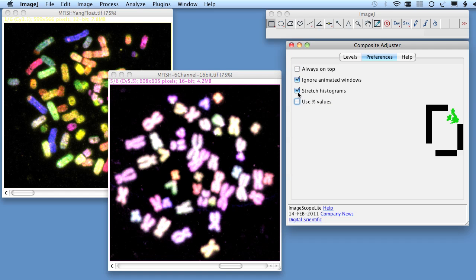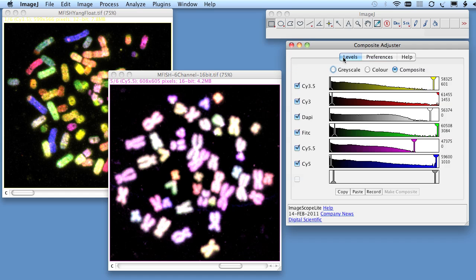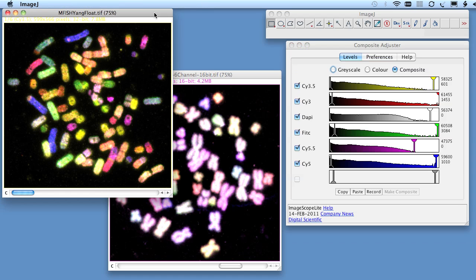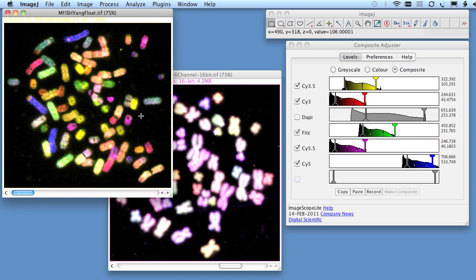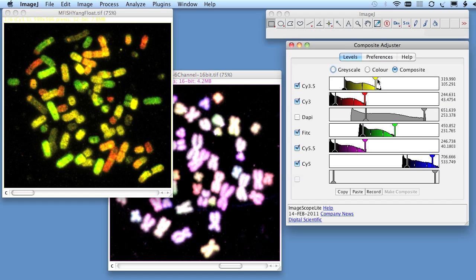Let's turn them off and look at our original image. Now we can see on the right-hand side, instead of percentage values being displayed, it displays the actual histogram pixel value.